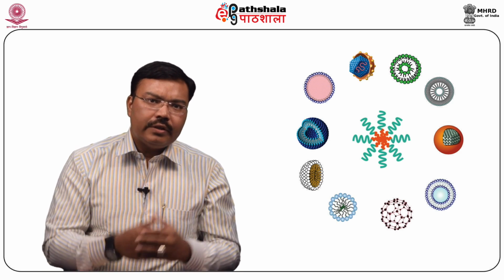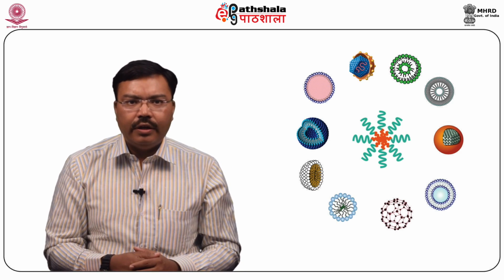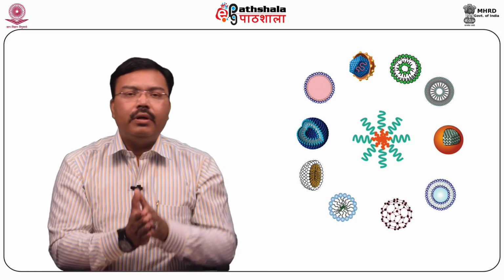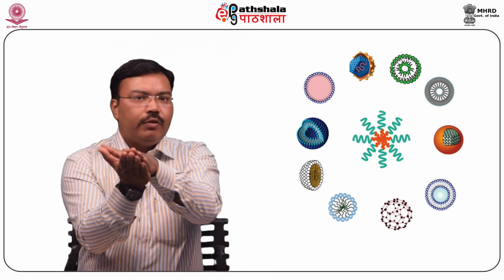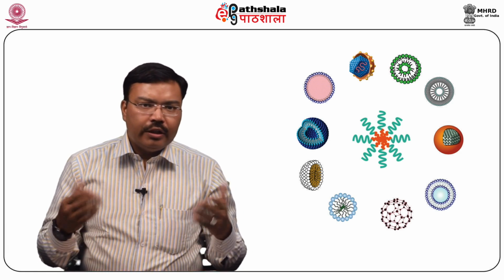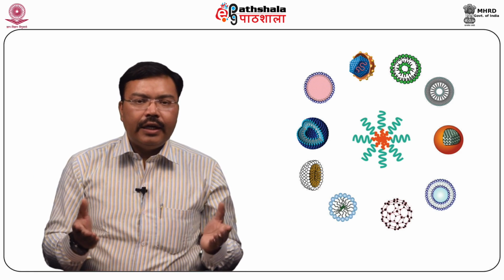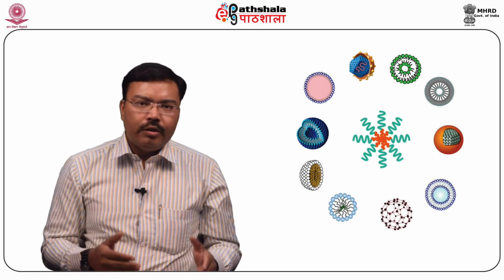In brief, a 1 mm cube sample size is generally taken. For liquid samples like a microemulsion, we sandwich the sample between thin metal sheets, and then these samples are frozen at around -100 to -150 degrees Celsius. The frozen samples then undergo microtome treatment.